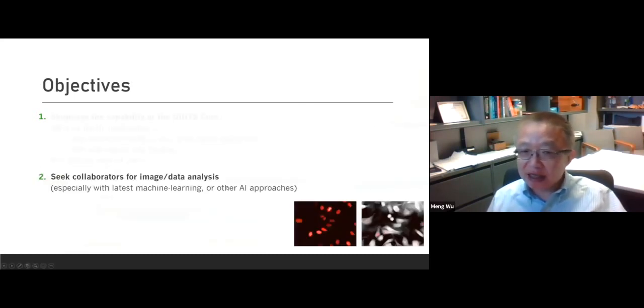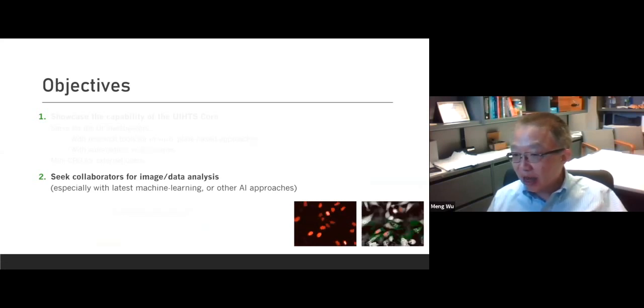The second one is that we want to do image analysis. Because we are doing high imaging-based work, we can do high content image analysis. You can see we can do this in a specific 10-minute interval to monitor the mitosis of the cells. For most image analysis, this is straightforward.